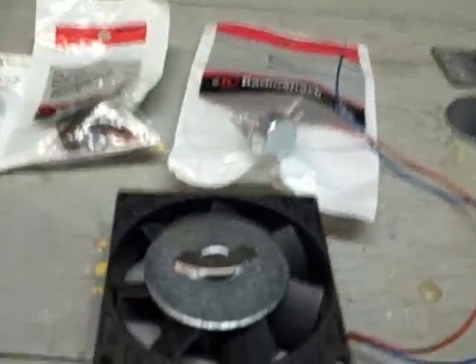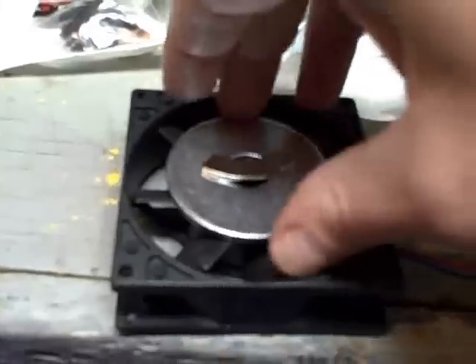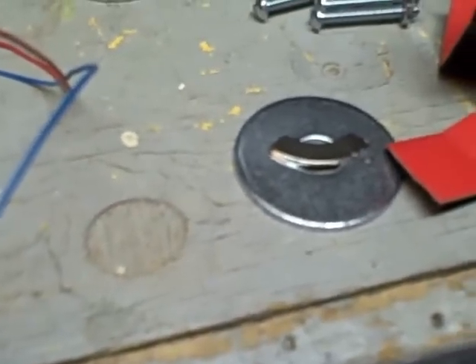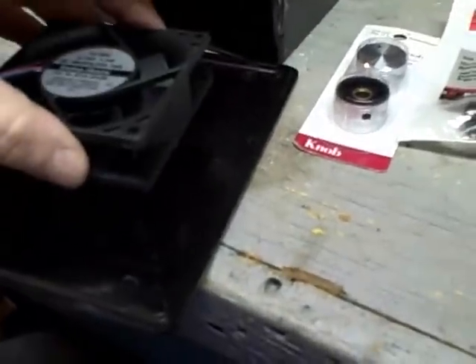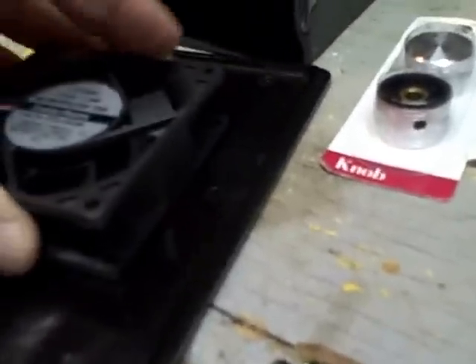Instead of gluing my washer down, I'm going to use super velcro — I love this stuff. I'll put a piece down there and a piece on the back of the washer, use it to move around and get it centered, and I think it'll hold just fine. Then I'll put spacers on here enough to mount it — probably 8/32 bolts. After everything is mounted, I'll space it so the magnet is maybe a quarter inch away from the lid.